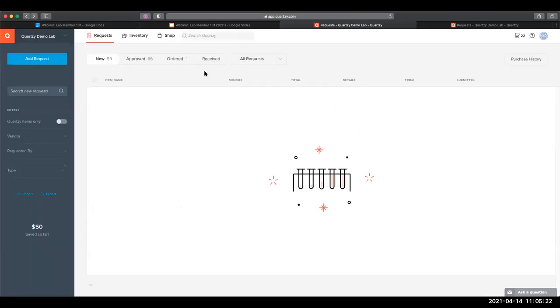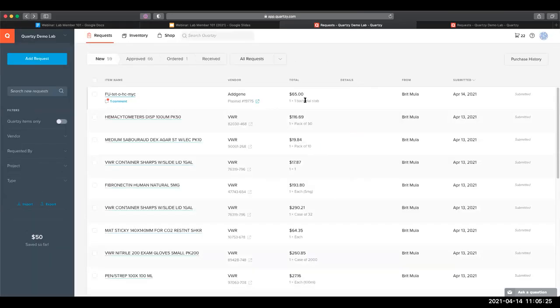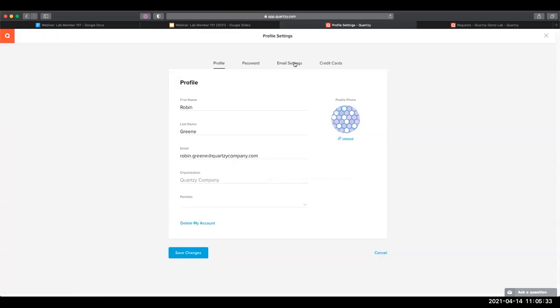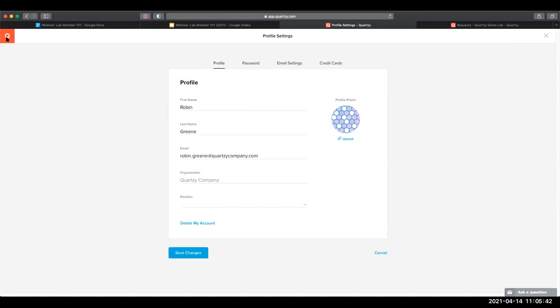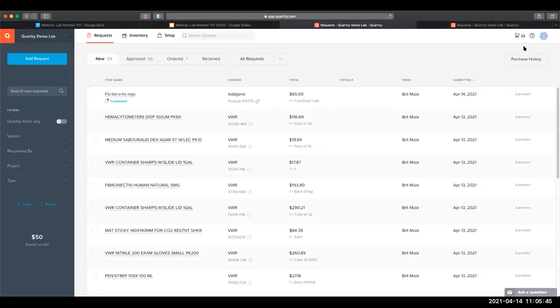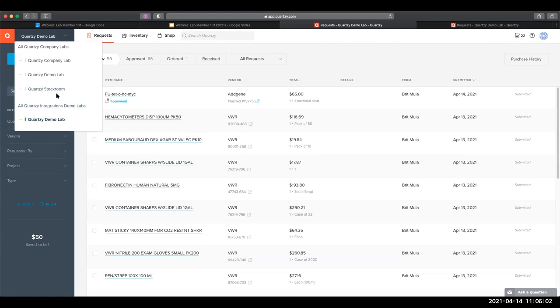So I was saying that your profile icon, where your profile settings and email settings are located, can be found here. This is where you change the frequency of your email notifications and things like that. We have the link to the help center right here, and your lab shopping cart here.